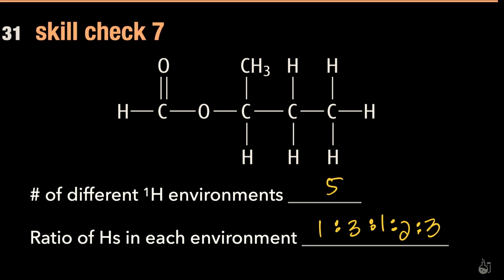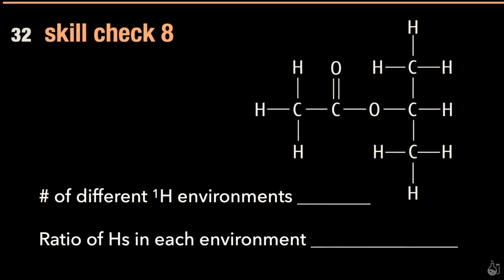It's definitely going to seem overkill, but the amount of molecules will do. The reason for doing so many molecules is that then interpreting the graph is easy because now you know what you're going to be looking for. You're not going to be looking for molecules, you're going to be looking for environments. So today is all molecule day. It's all molecules and their environments.